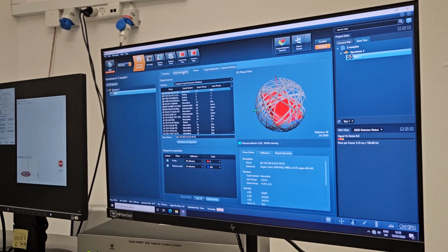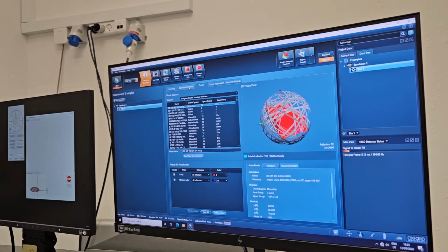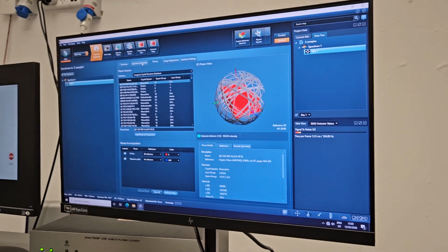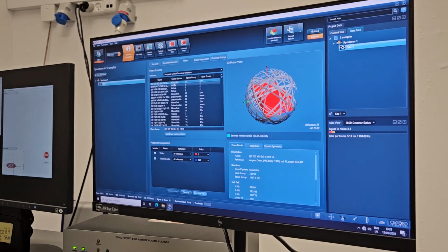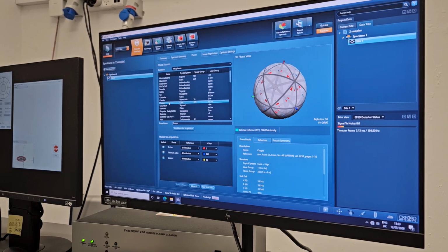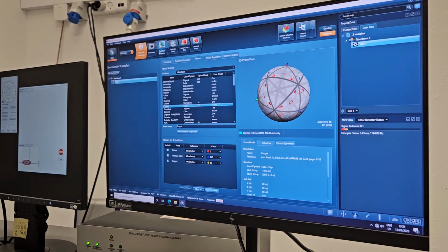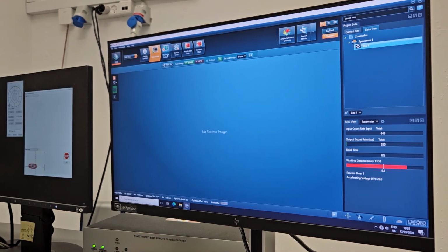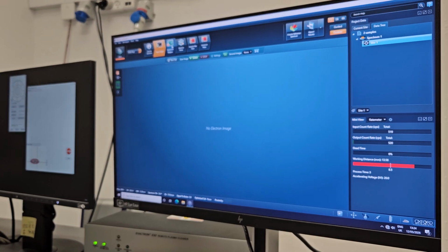So you have aluminium and then you present the data. Did you study stainless steel? I don't remember that. The software will show you, you studied stainless steel, because it did change. The phase is here. So let's see whether we have a couple. Yeah, of course we have. Okay, we have chosen. I have no idea about the geometry, so I will not apply any sample rotation. This you can change later.